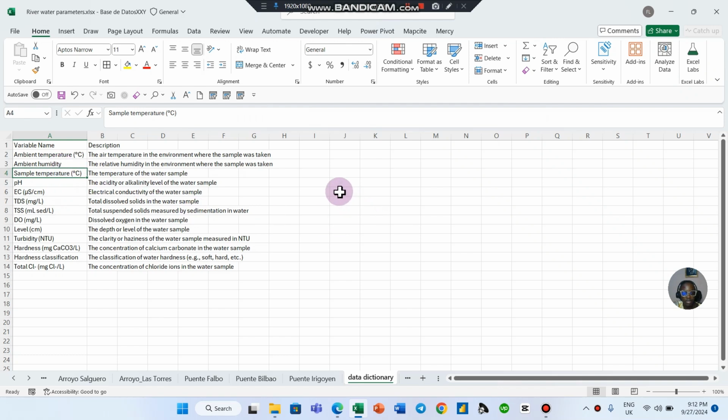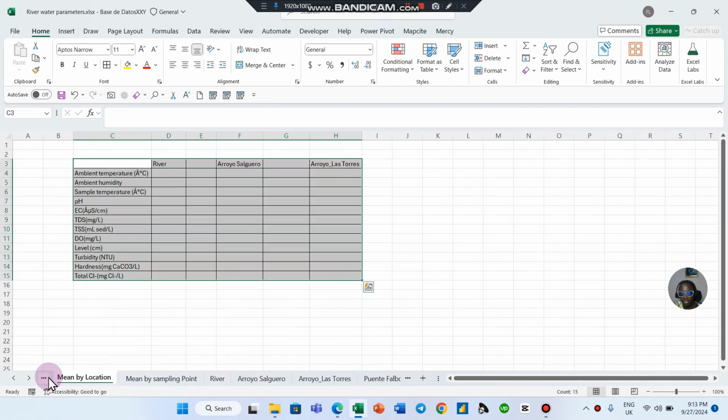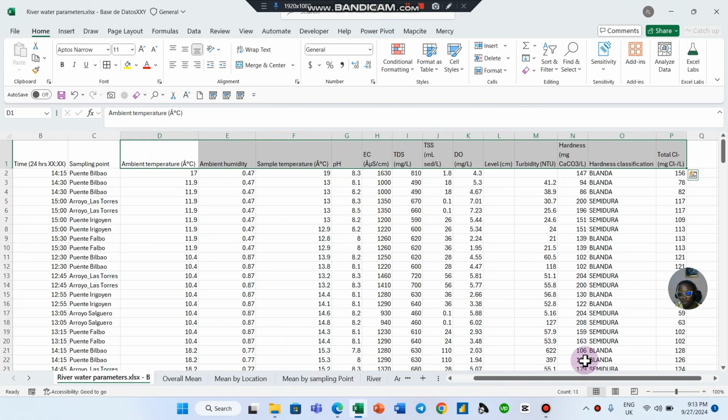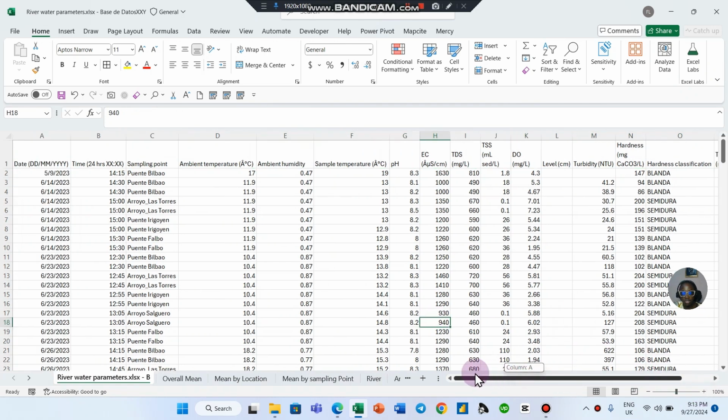All of these should be within a particular range, and that is what the researcher can use to judge if the water sample is good, or if it falls into the recommended criteria in the standard books. Because we took several samples, for you to compare, what will be done is that the mean of the different samples will be taken based on the different groups.